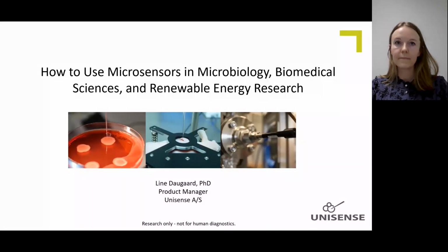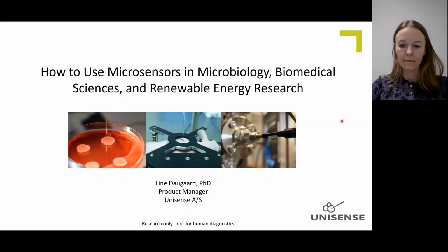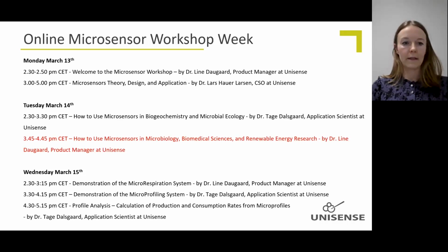Now we will move the focus onto how we use microsensors in microbiology and within biomedical sciences and also within renewable energy research. So I will just share my presentation here. Okay, great. Yeah, and this is the second lecture of the day. Tomorrow we will go to the lab and do the live demonstrations of the microrespiration system and the microprofiling system.